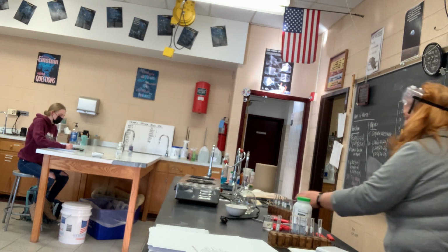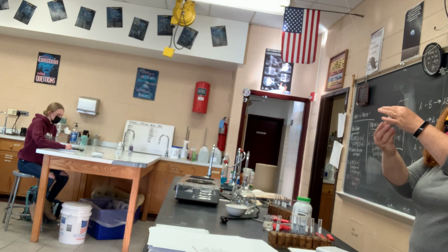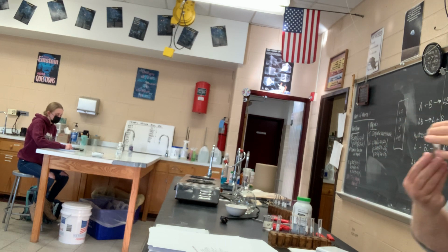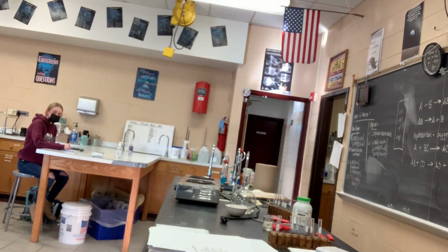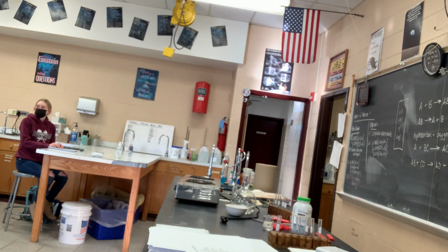So that one's dirty. The other thing is, this is the one that the zinc and the hydrochloric acid is in, and it's hot. It's hot to the touch, not super hot. If you feel it, let me just touch the bottom of it. It's making energy, it's changing in temperature. And look at the stuff on the bottom. It's not even zinc anymore, it's this black stuff, and it makes a whole bunch of heat. So that's another way you can tell that it's a chemical reaction.